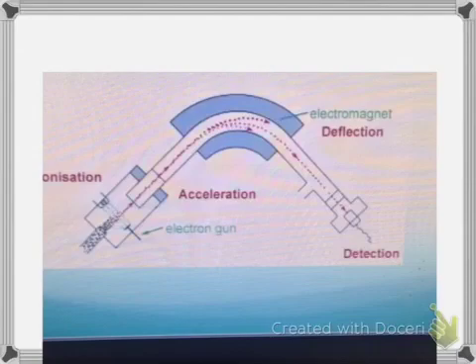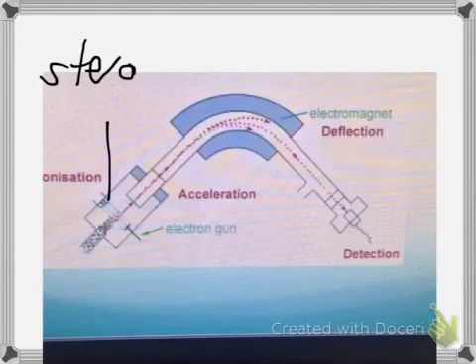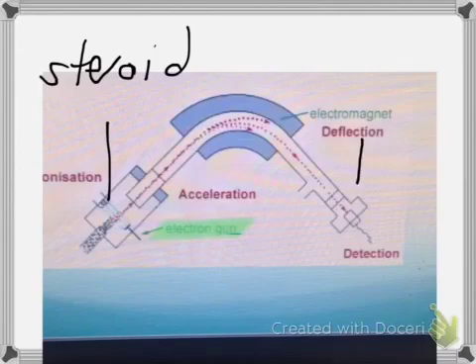If we first look at the athletes, I can run my sample. If I had any steroids present, I would have it in the urine. The urine would be vaporized. My steroid would be bombarded with electrons as normal with my electron gun, then accelerated through the accelerator and deflected through the deflector. Then I'd get it detected, and I'd get some sort of fragmentation pattern.